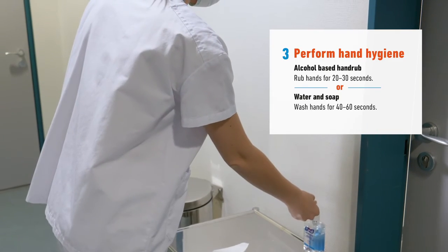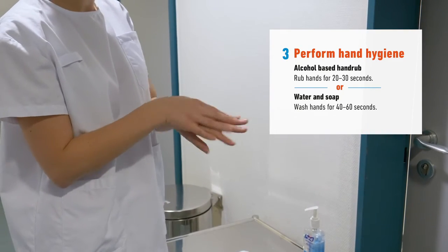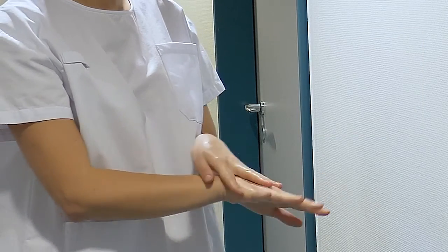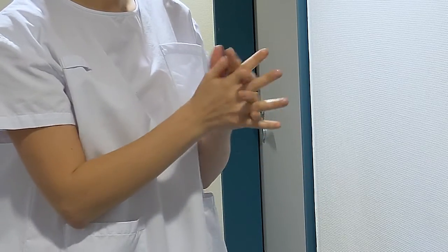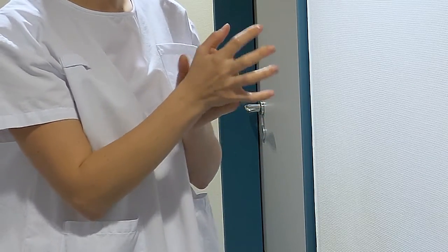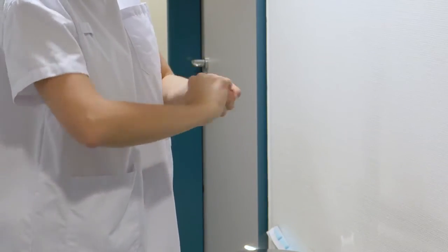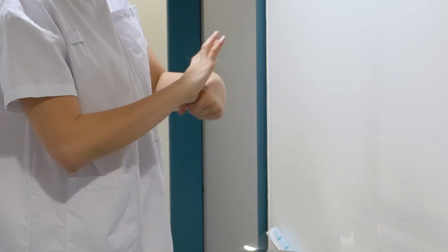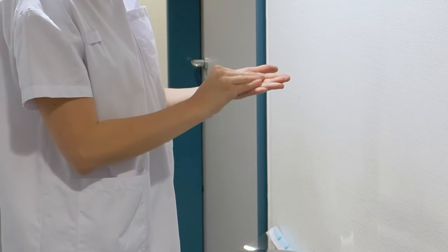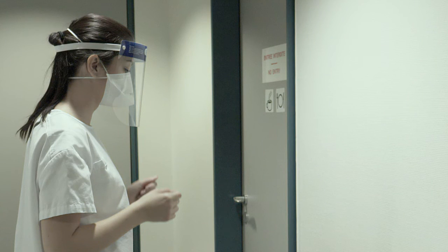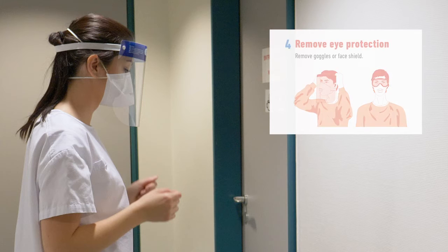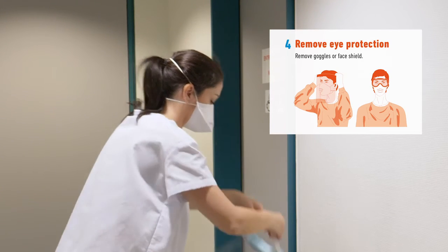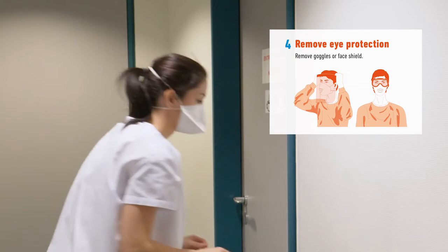Next, perform hand hygiene with alcohol-based hand rub for 20 seconds before touching your face to remove the eye protection. Remove the eye protection by leaning forward and pulling it away from your face. Ensure you clean the goggles or face shield if they are reusable and place them in a clean container.